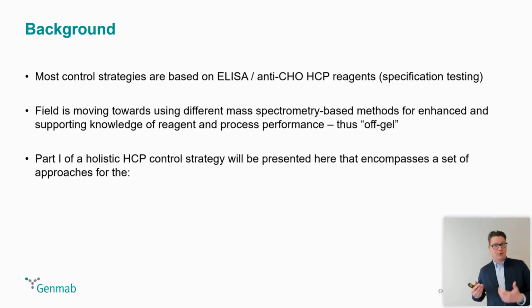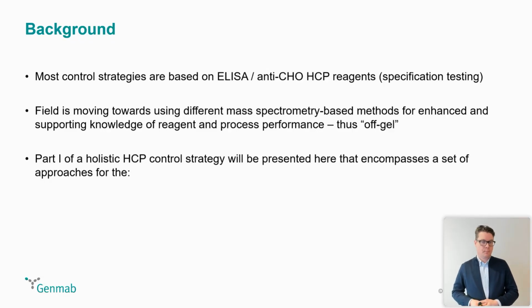This is why we call it off gel, because there's been a tradition in the way you look at the ELISA reagent coverage, based mostly on a 2D gel analysis to see how well your ELISA reagent performs. The challenge we saw is that even though you do this gel, you still don't really know if you have any issues with HCPs. You still have HCPs in there that could be a problem for your patient or for your product.